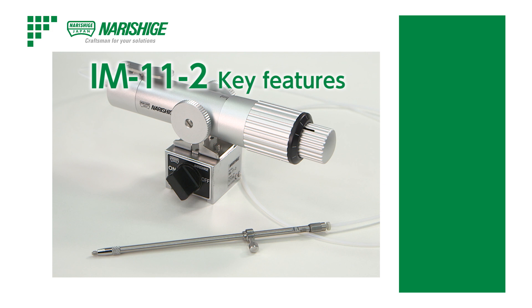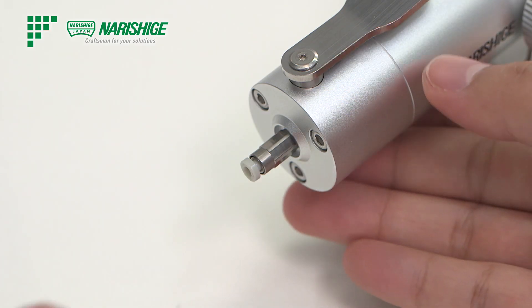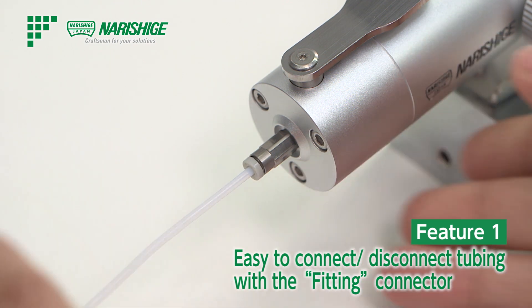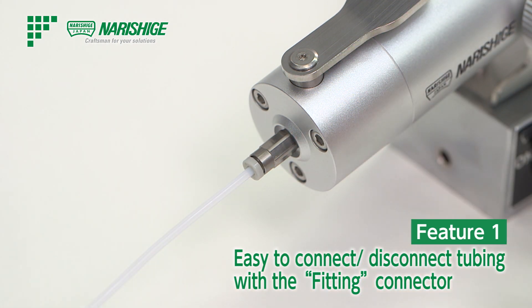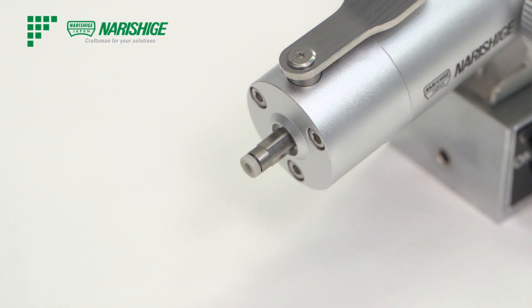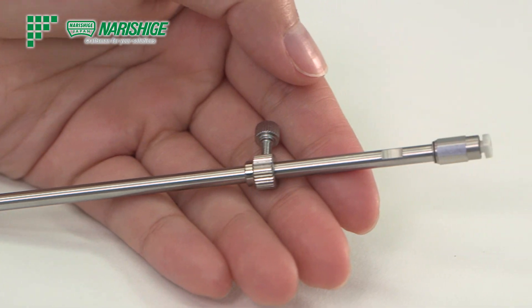The IM-11-2 comes with many unique features. One of them is easy connection of the tubing. It has a fitting mechanism that makes attachment and detachment of the tubing quite simple, making regular maintenance and removal of broken pipette pieces much easier.